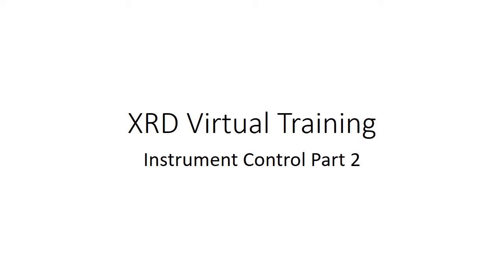Welcome to X-ray diffraction virtual training. This is the second part of instrument control.